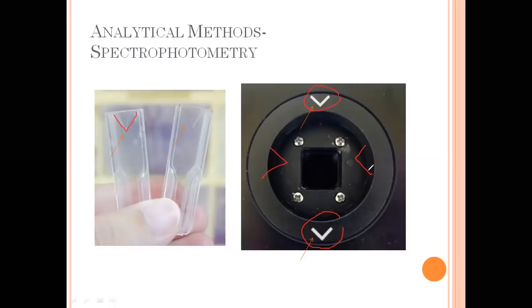So there could be an effect on the result of your sample. Okay? Hindi po pwedeng ganun kasi the importance of the spectro is the light path. Okay? Kaya dapat susundin mo siya. That's why always remember that when you insert the cuvette on our cuvette port using our spectro, kailangan arrow to arrow sila. Okay? Arrow to arrow. Naintindihan? So sana malinaw, sana clear.